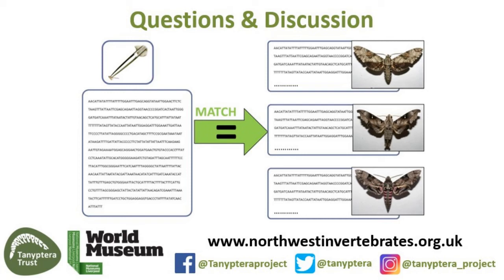We have a question from Jeff Garnus. He says, do you primarily or exclusively use COI for metabarcoding of insects? What do you do about COI pseudogenes in the nuclear genome? And is there anything that can be done for groups where COI doesn't resolve? Quite a few questions in one there.